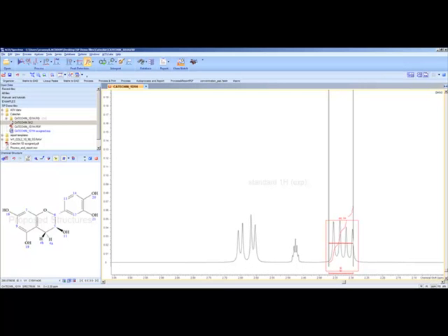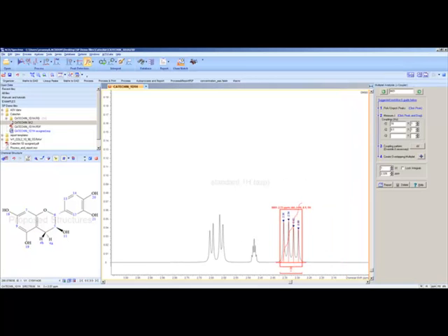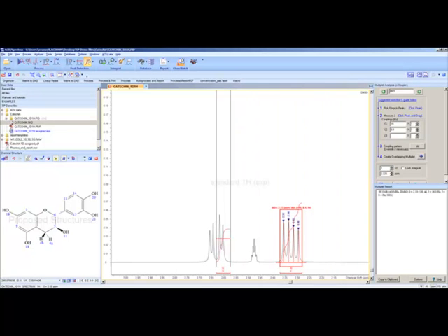The area under the line is automatically integrated, and peaks above the line picked, allowing you to avoid picking impurities. Also important is that the multiplicity is being determined. This allows for the generation of the multiplet report I showed you earlier as you process. Watch as I continue processing.